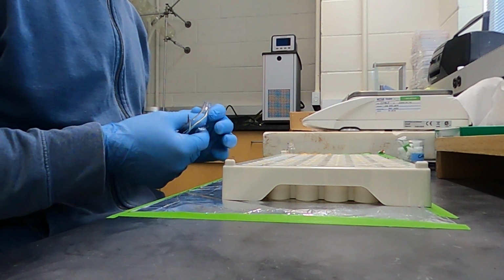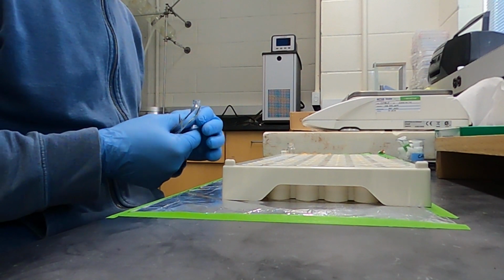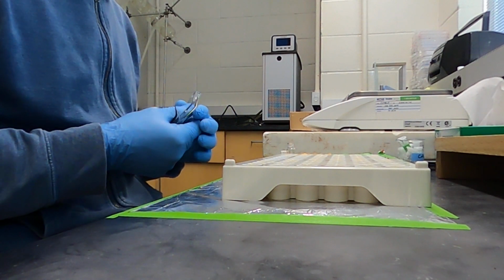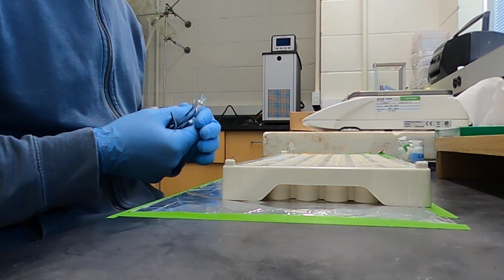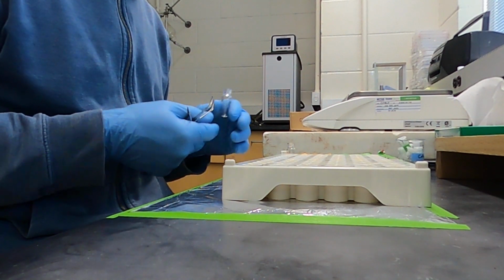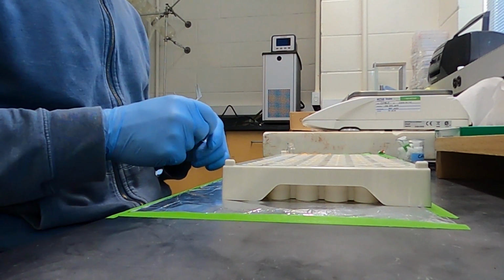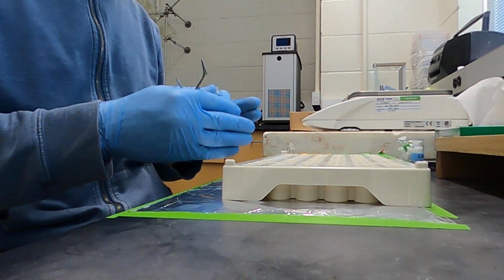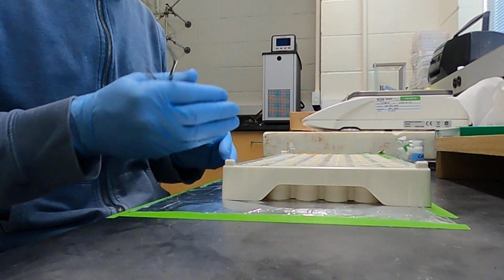The reason why it's important is because the IRMS is sensitive to the amount of material, meaning the delta value it's going to return will change based on how much material is put in a vial. So there's several ways to get around this. The first one is to weigh the exact same amount. So we try to do this as best as we could.